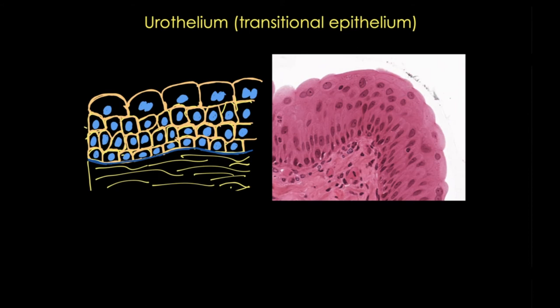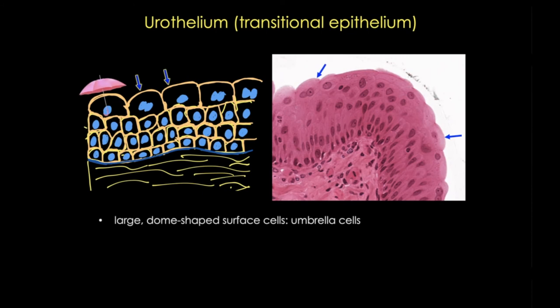Here we see a cross-section of the ureter. We first want to take a look at the cells on the apical surface. In urothelium, these cells have a very characteristic shape — they don't really look cuboidal or columnar, but they're called umbrella cells, and they're unique to urothelium. These are large puffy cells at the apical surface that often bulge out into the lumen, and some say they resemble an open umbrella. These highly differentiated cells protect underlying cells against hypertonic urine, and they have the unique ability to increase and decrease their apical surface area with bladder filling and emptying. They do this because they contain unique intracellular junctional complexes and apical membranes, allowing the shape to change from round to flat.